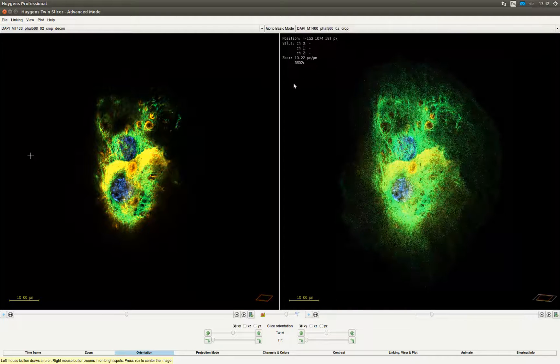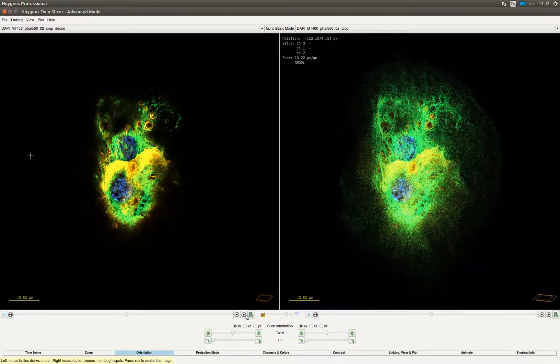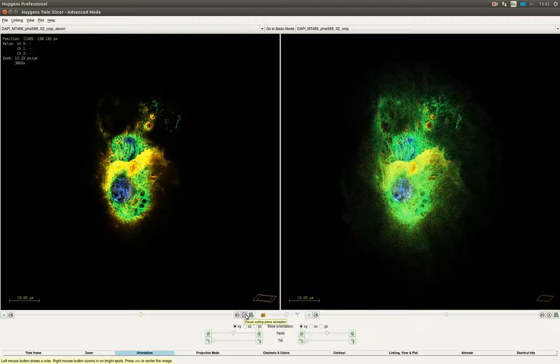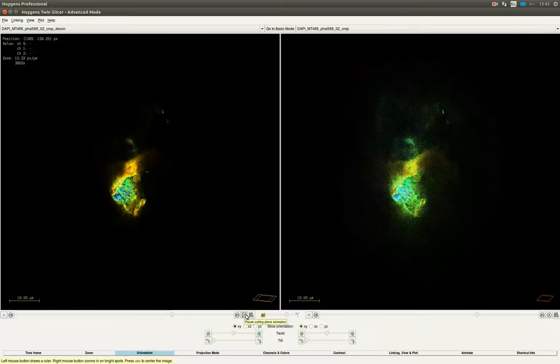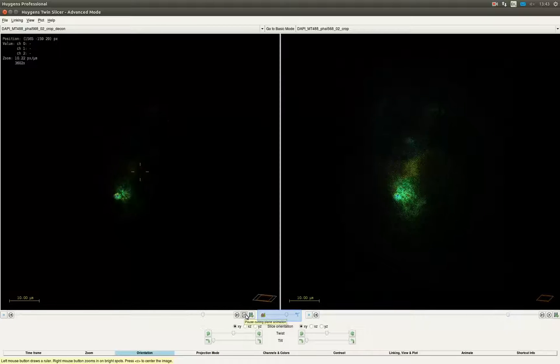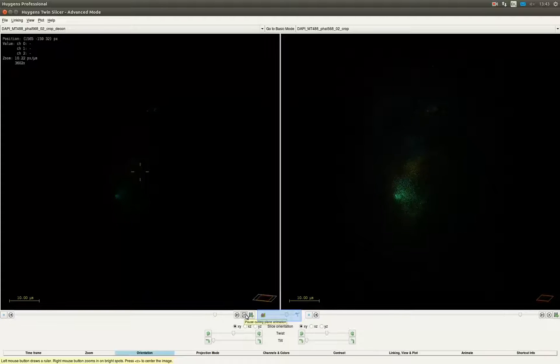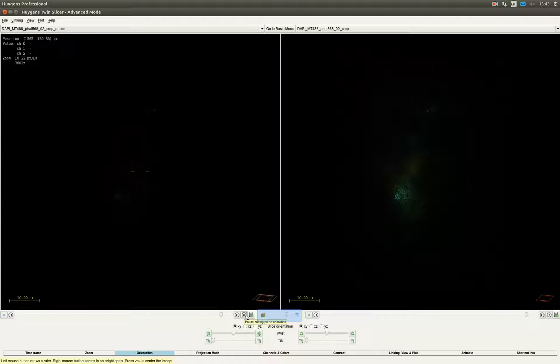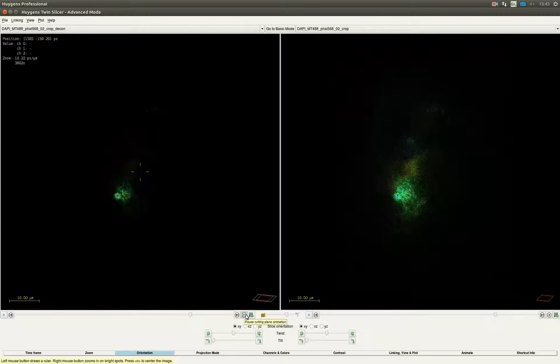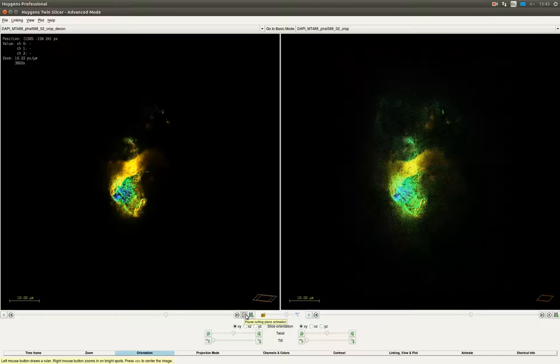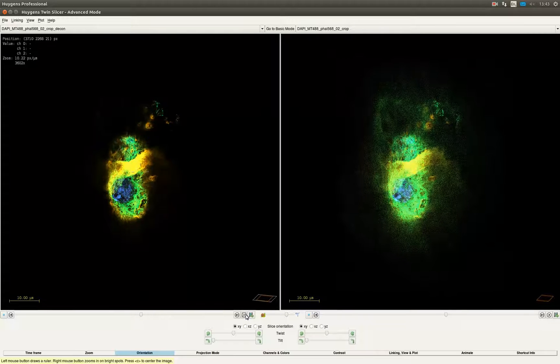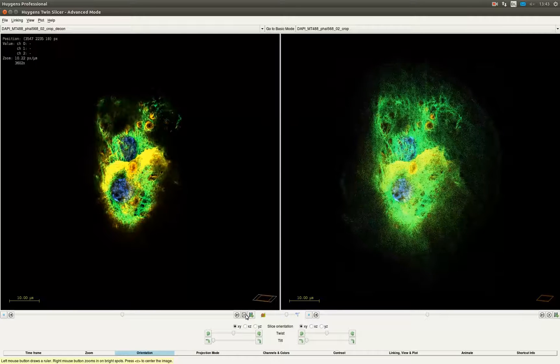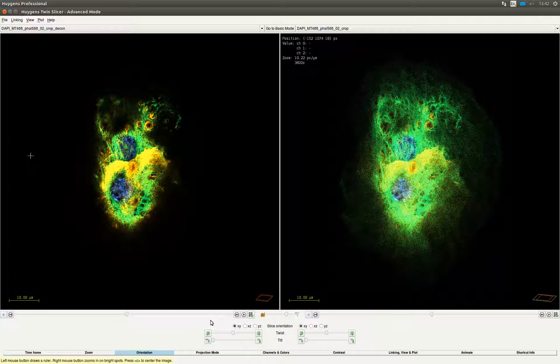By dragging the slider underneath one of the two images you can move through the time frames. By clicking the play button Huygens will automatically move through the time frames of both images. You can adjust the animation speed with the slider underneath and between the two images. After clicking the pause button again to pause the animation, we are going to have a look at what else can be done in the TwinSlicer.